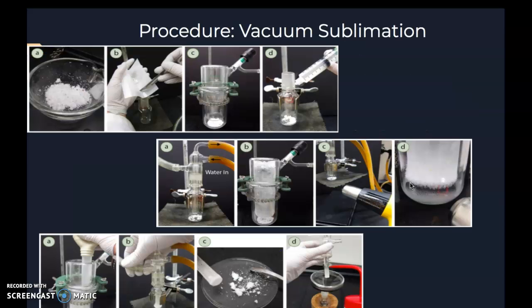It is most common to use vacuum sublimation when attempting to sublime volatile substances, since some substances will char or decompose if heated under standard atmospheric pressures. Step 1. Place the dry solid at the bottom of the apparatus. If the solid is chunky, crush with the mortar and pestle. If the solid is wet, condensation may form during sublimation, which may cause crystals to wash away.